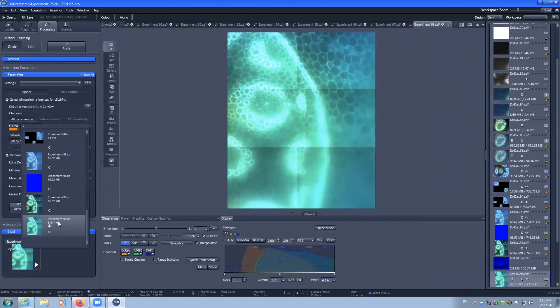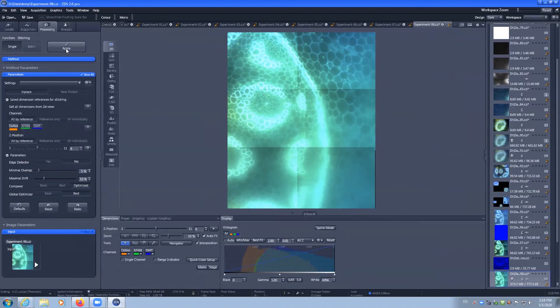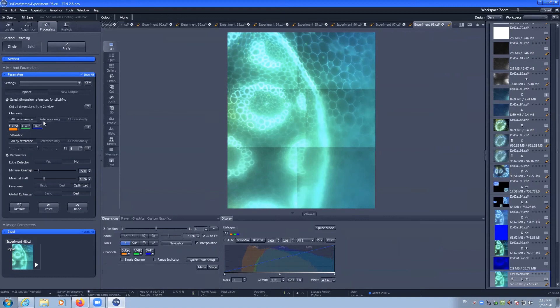We can select our input as that last one. And our image should then be stitched. Some of the settings that you can use are which channel it's referenced against and which Z slice to be the reference Z position.